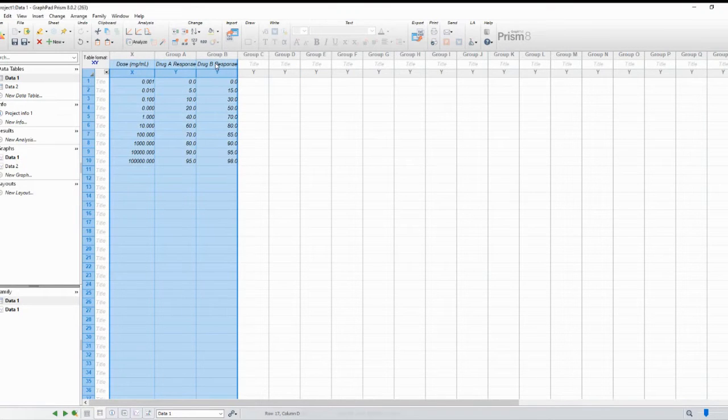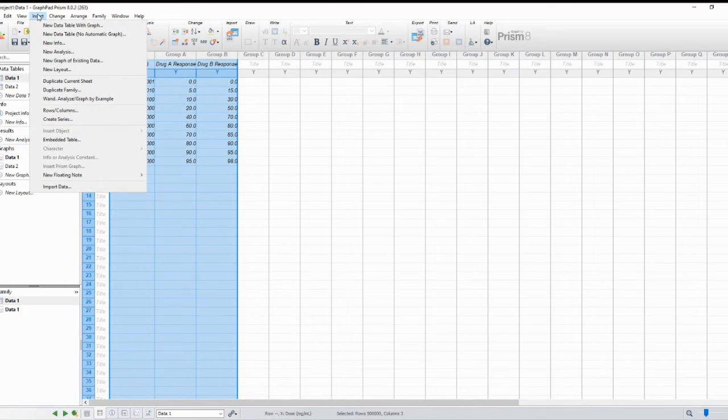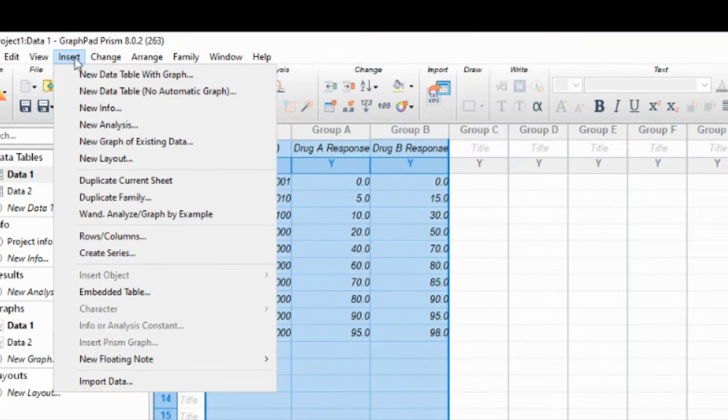Now that we have our data ready, let's create a dose-response plot. Go to Insert and click on New Graph of Existing Data.